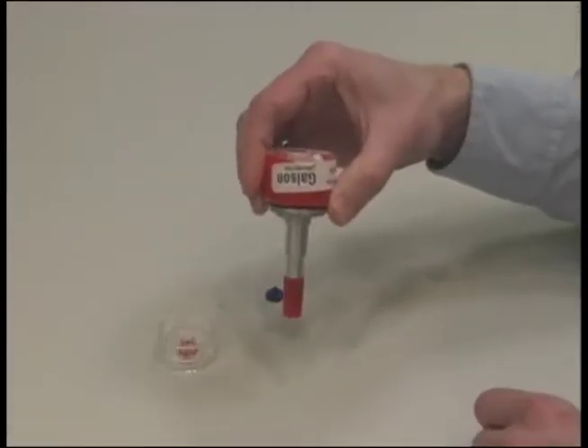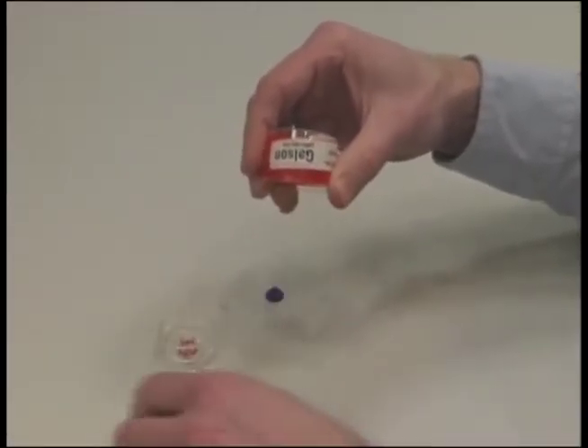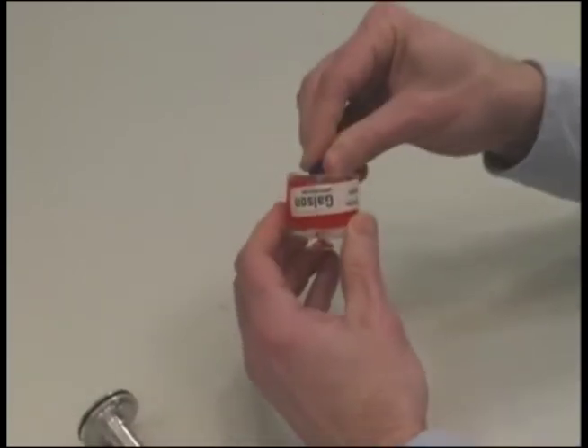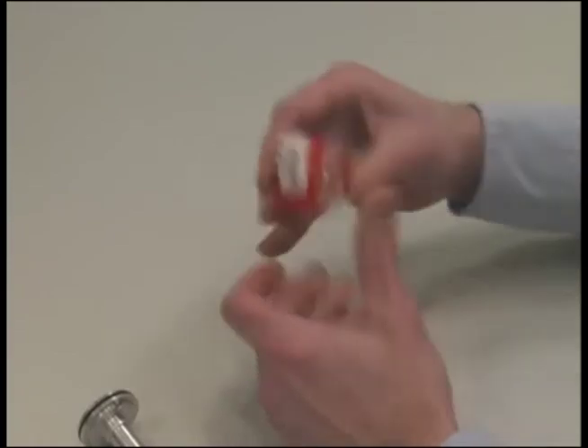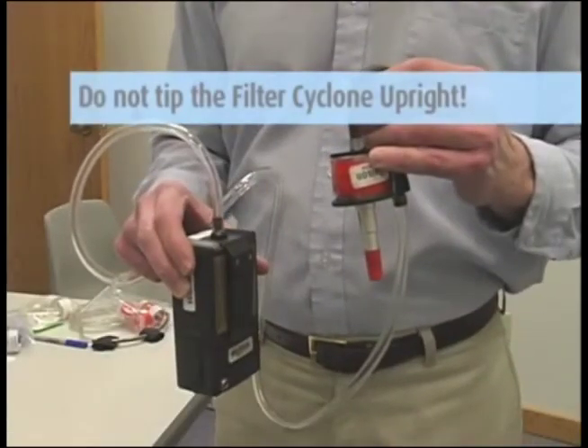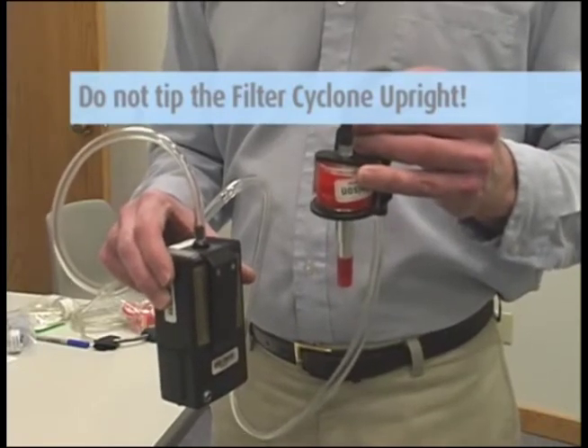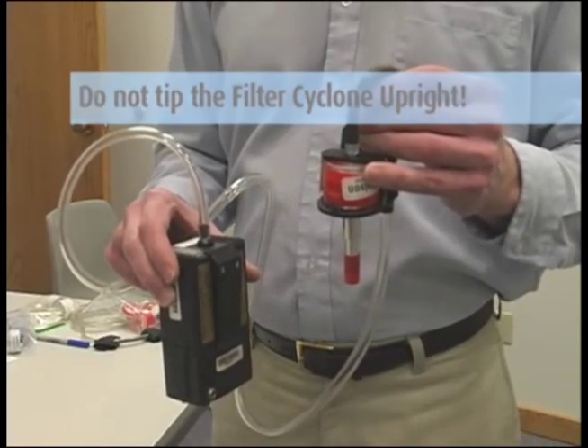After sampling, keep the filter cyclone holder pointed down as you remove the cyclone and replace the top part of the filter cassette and both colored nibs. It is important that you do not tip the filter cyclone upright so that you do not spill any of the larger particles captured in the cyclone onto the filter.